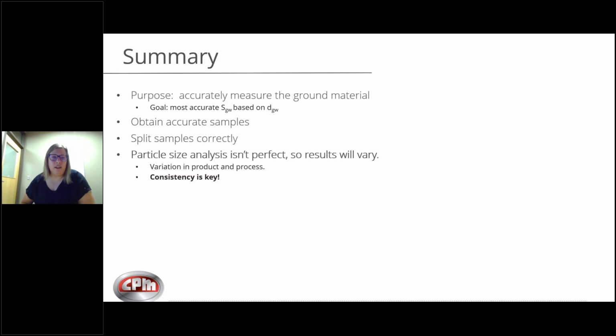Keep in mind that particle size analysis is not perfect and it varies based on the product and the process. That's why consistency is key: making sure that you're using the same method and arrangement, and that your technicians are obtaining and splitting those samples the same way each time.